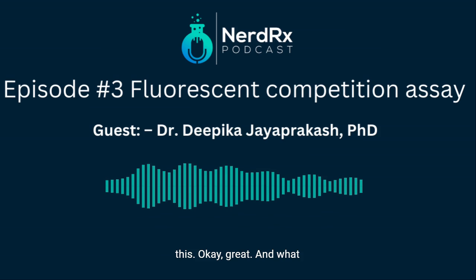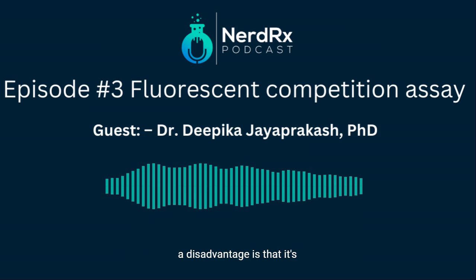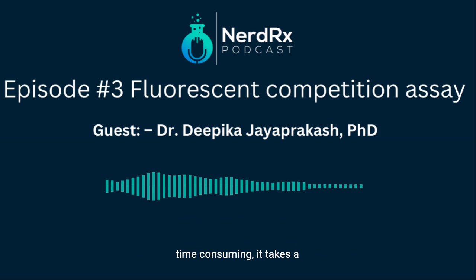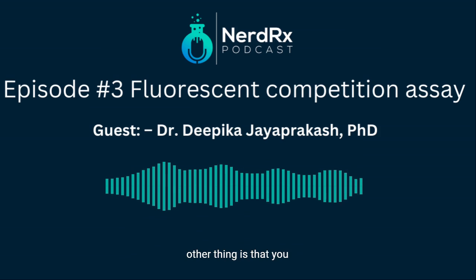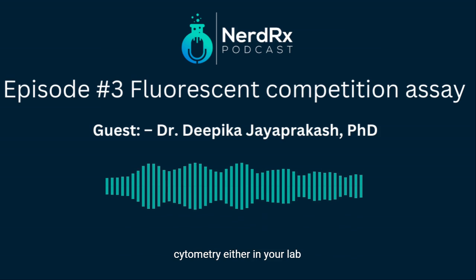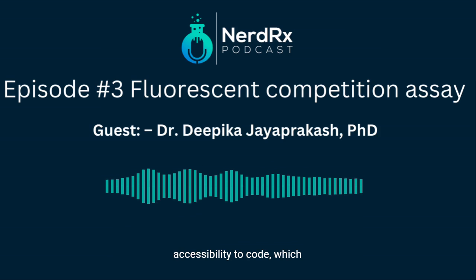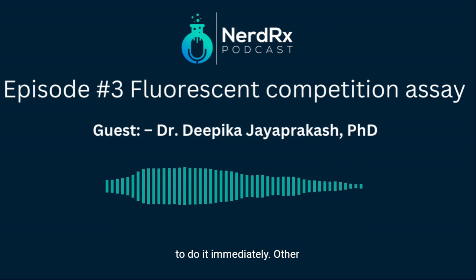Great. And what about the other side? What are the disadvantages of these techniques? Yeah, the advantage itself is a disadvantage: it's time consuming. It takes a long time. That said, one other thing is that you require FACS accessibility. You should have a flow cytometer either in your lab, or you should have access to a core, which then means you will have to keep going to the core back and forth to get the samples there. As this has to be run live, it'll be time sensitive. You will have to do it immediately.